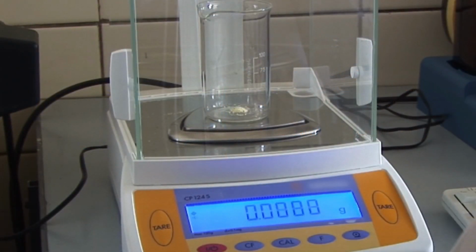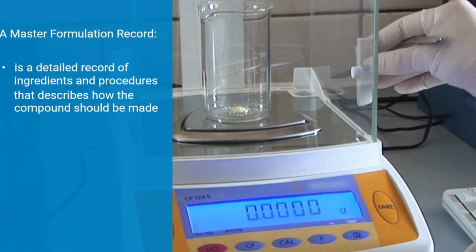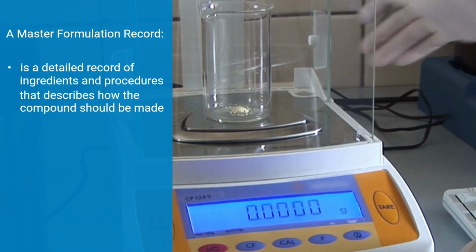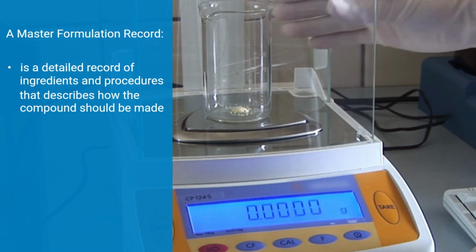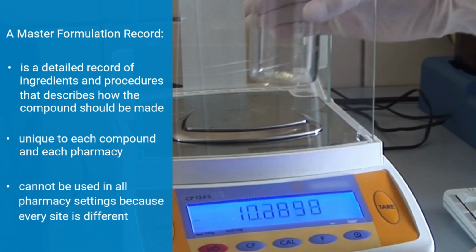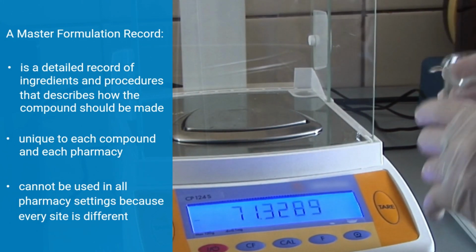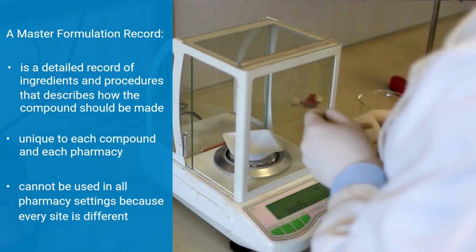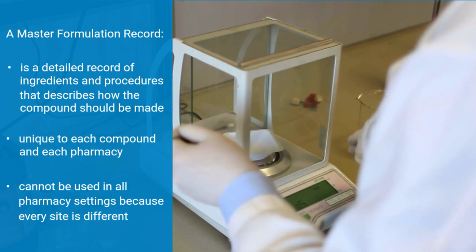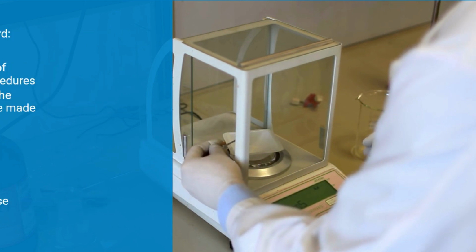Compounding must be done in accordance with a master formulation record, or MFR. An MFR is a detailed record of ingredients and procedures that describe how the compound should be made. It is unique to each compound and each pharmacy. There is no generic master formulation record that can be used in all pharmacy settings because every site is different. For example, risk mitigation strategies and precautions may be different depending on staffing or workflow in one pharmacy versus another.